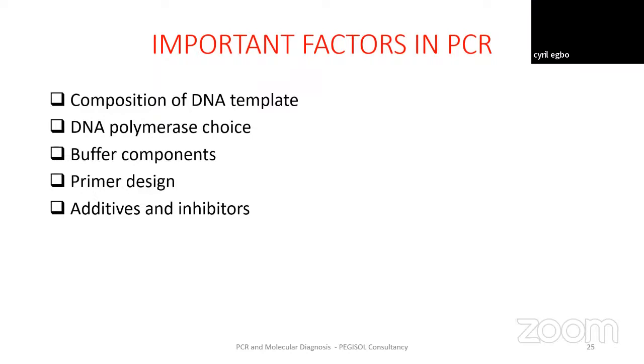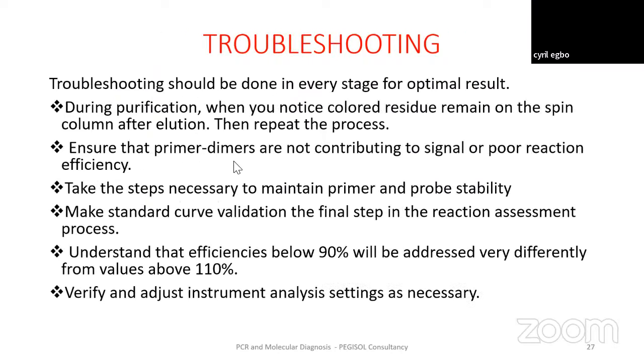For instance, a bottle that is meant for 10 ml of sample, you just use it to collect 5 ml instead of 10 ml, which means there is still excess anticoagulant in that specimen bottle that could inhibit the reaction of this PCR process. So that is what we mean by some of these factors that can affect this PCR process.